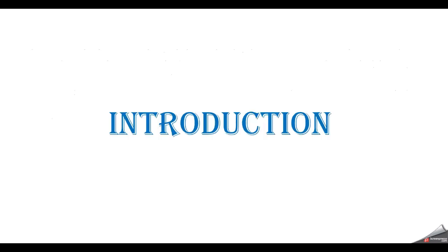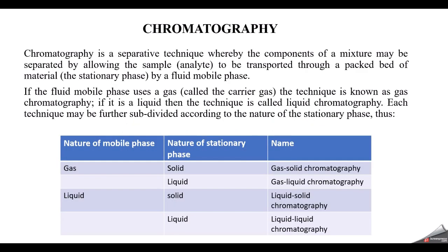Today let us discuss column chromatography. Introduction. Chromatography. Chromatography is a separative technique whereby the components of a mixture may be separated by allowing the sample to be transported through a packed bed of material by a fluid mobile phase. If the fluid mobile phase is a gas, that is carrier gas, the technique is known as gas chromatography. If it uses liquid, then the technique is known as liquid chromatography.